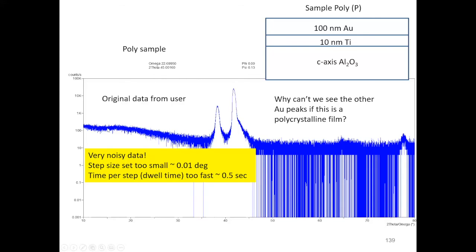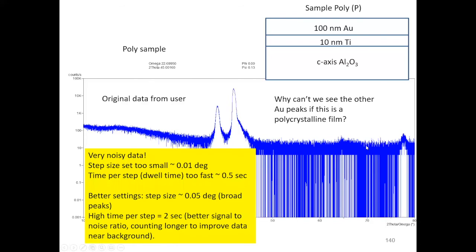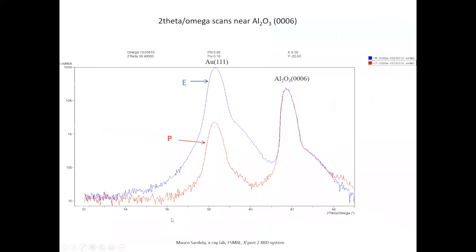We still have this difference between the intensities. This peak is from sapphire. We're puzzled about the other intensities. So then we start saying, well, anytime we have a thin film, things start getting weird. We actually move to the position where this gold peak should be, and we start doing rocking curves, using the other kinds of scans that are available in the instrument to see what's going on here.